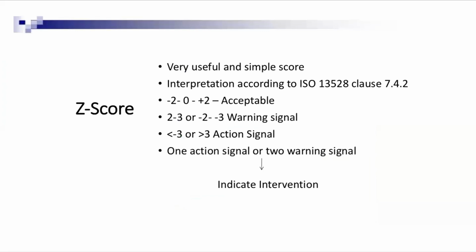In quantitative EQAS, the PT providers give us a Z or standard deviation index. These are the same thing, but it is better to use the term Z score because this is the standard statistic in proficiency testing. In this, they have mentioned Z score, so it is better we use the same term.